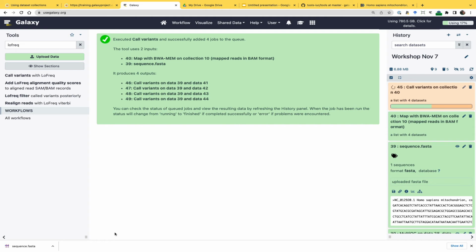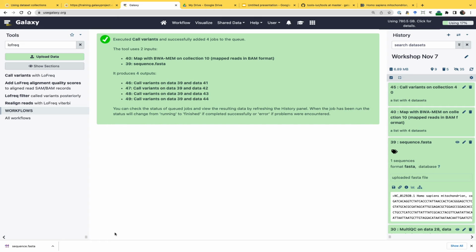At any given position, you can have a homozygote just like in the reference, so it's the same base as in the reference. Or you can have an alternative homozygote, a position where you have a different base, and it's uniform across all reads. Or you can have a heterozygote, where you have, for example, a reference base from father and an alternative base from mother. But you have this diploid expectation where you have either 100% or you have 50-50.